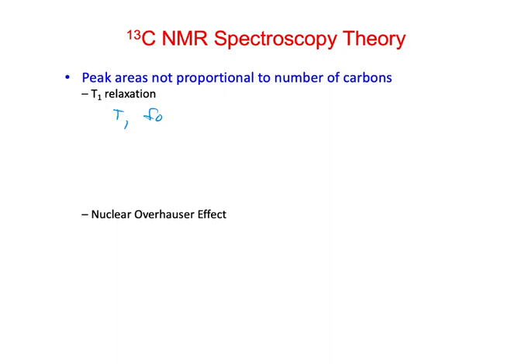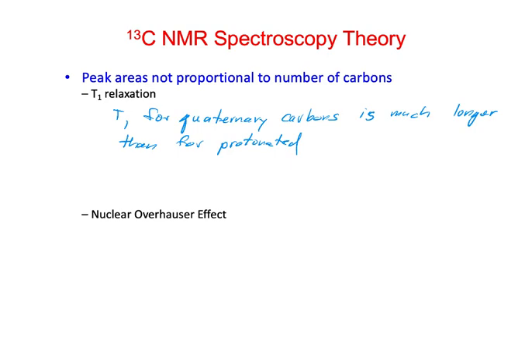T1, especially for quaternary carbons, is much longer than for the protonated carbons. Is it just because of the NOE? No. The T1 is different than the NOE.